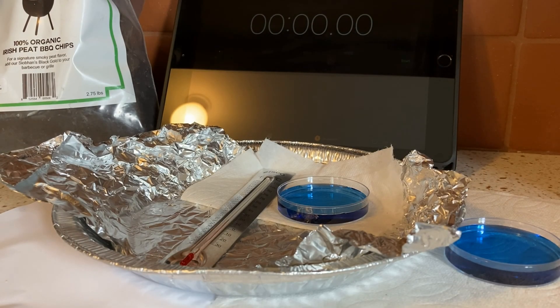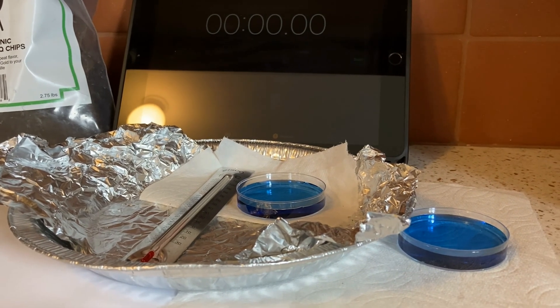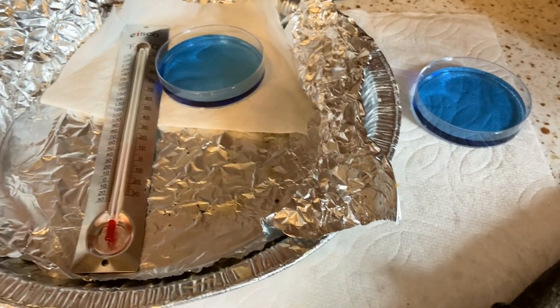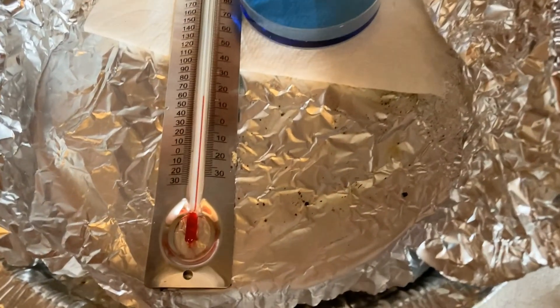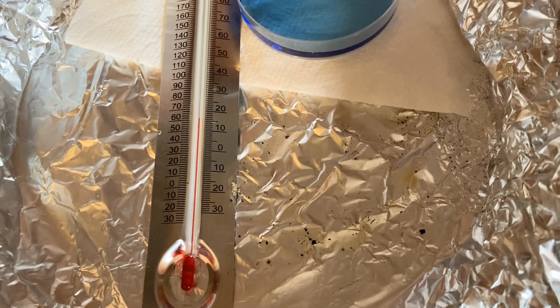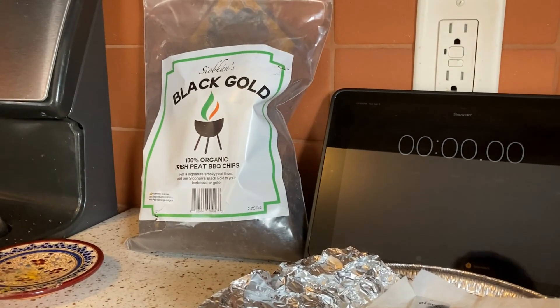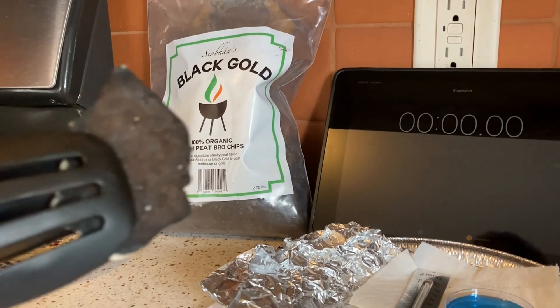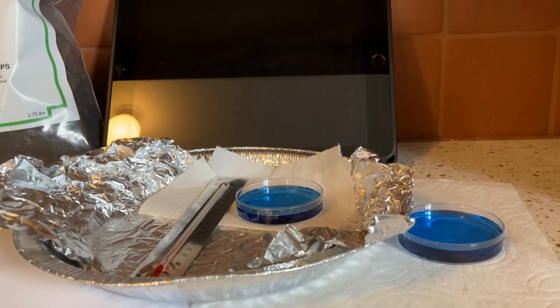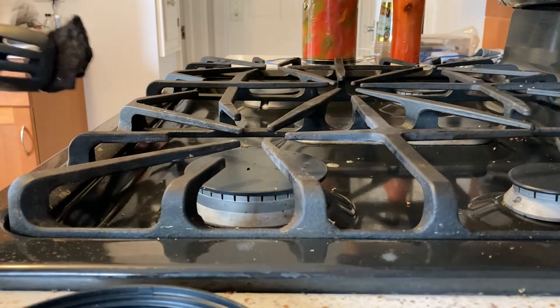We are ready to begin. I've got a couple of containers of bromothymol blue — they're both blue right now. I'm taking a look at temperature to begin with. I have a timer, my bag of Black Gold peat chips, and I've removed one of the smaller peat chips which I'm going to burn.